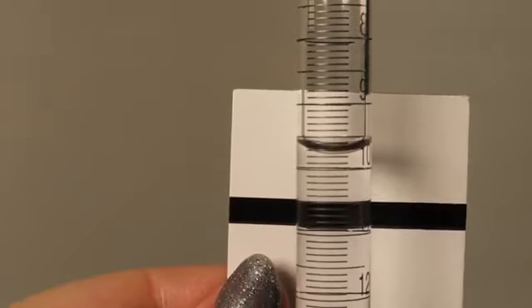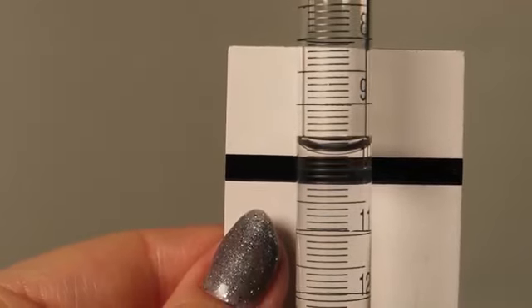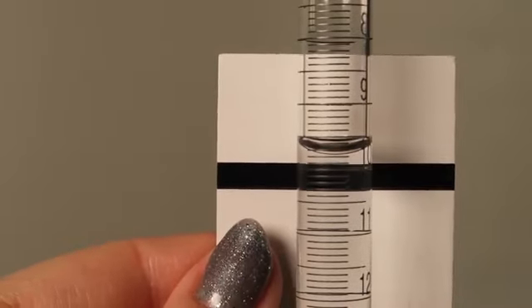Using a reading card. A reading card is used to sharpen the bottom of the meniscus to achieve more consistent readings. Notice how the bottom of the meniscus becomes darker and moves as the black line of the card is brought close.